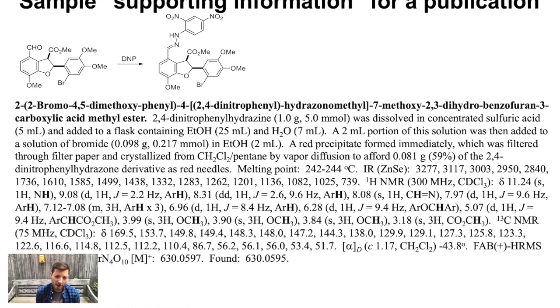At the very top on the right shows chemical representations for the reaction. This is an ester, I'll say, that's been reacted. Actually, the aldehyde group at the very top turns into what's called a hydrazone. This is actually a reaction I did many years ago, so this is from one of my old pieces of research when I was in graduate school.